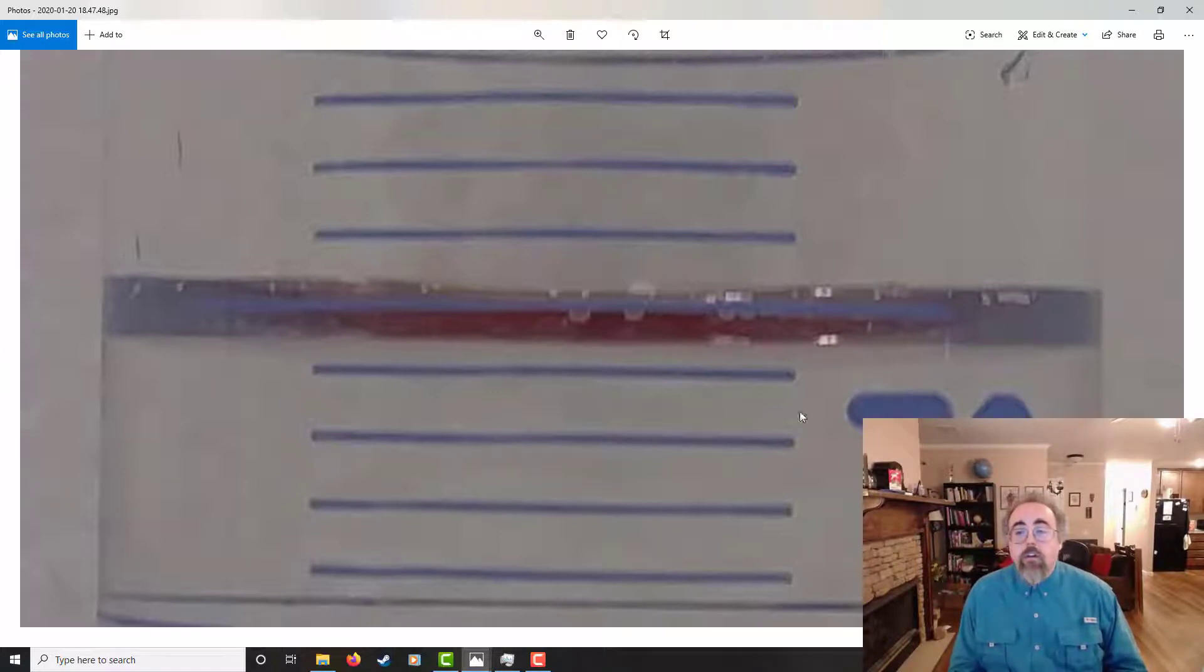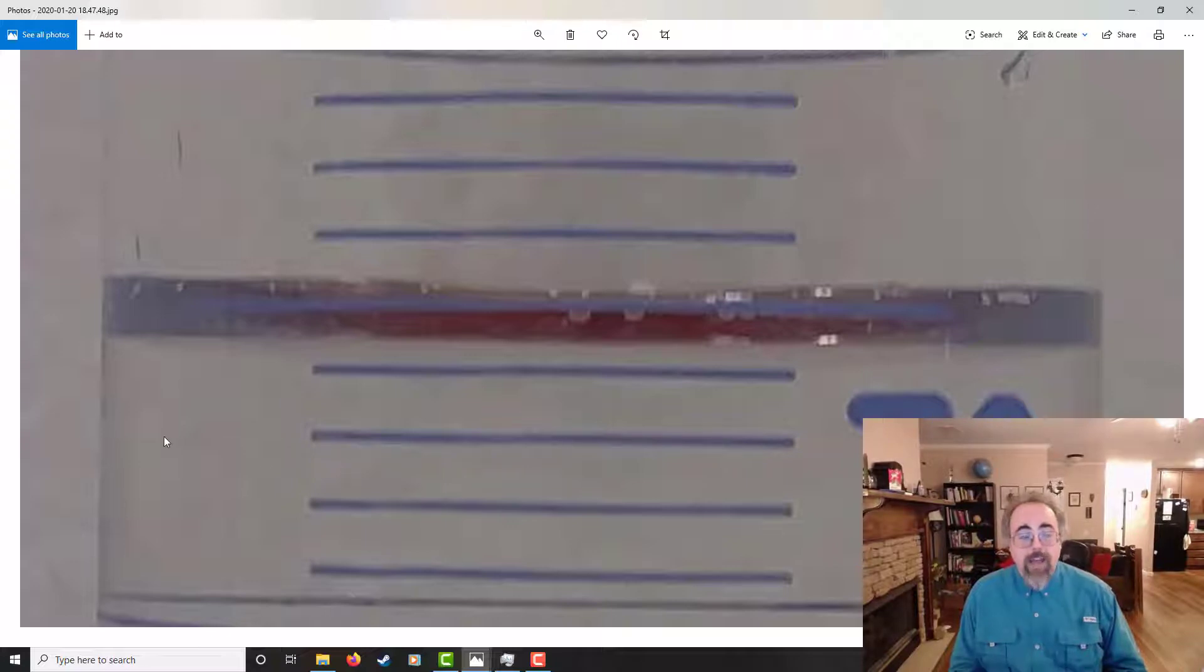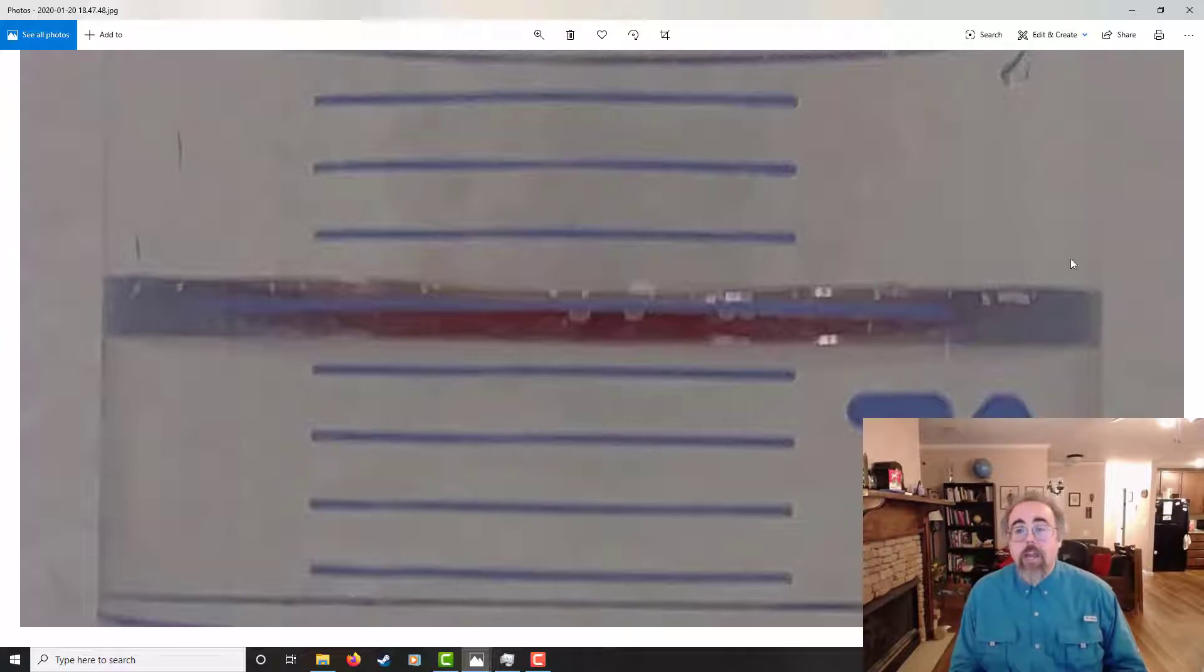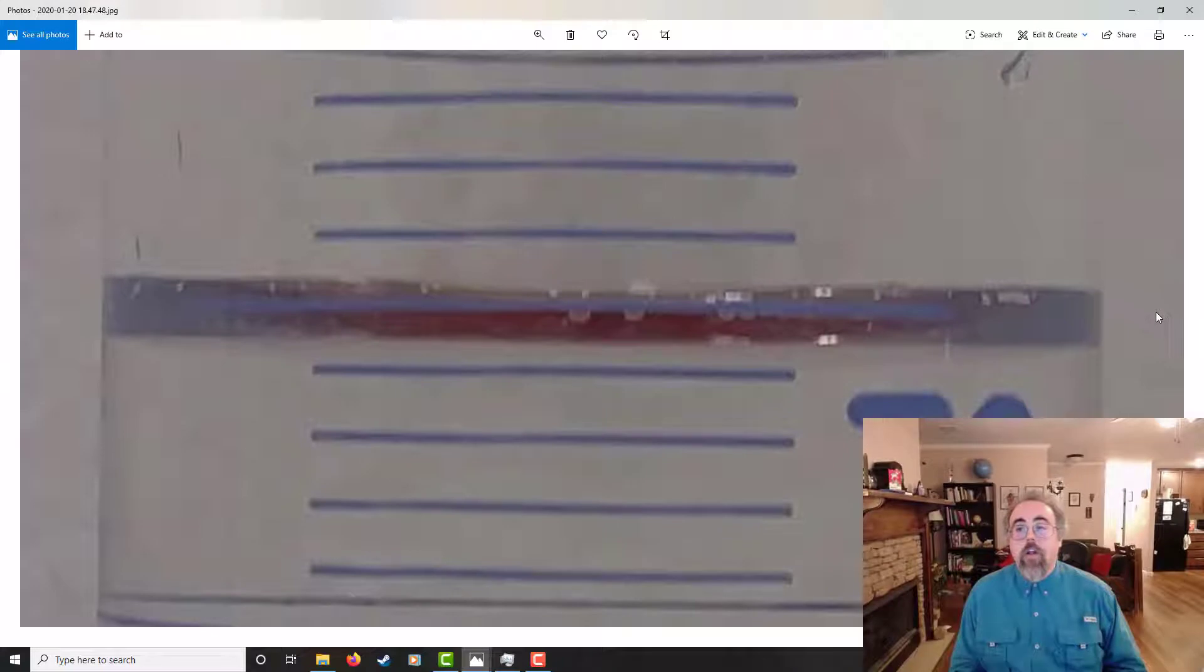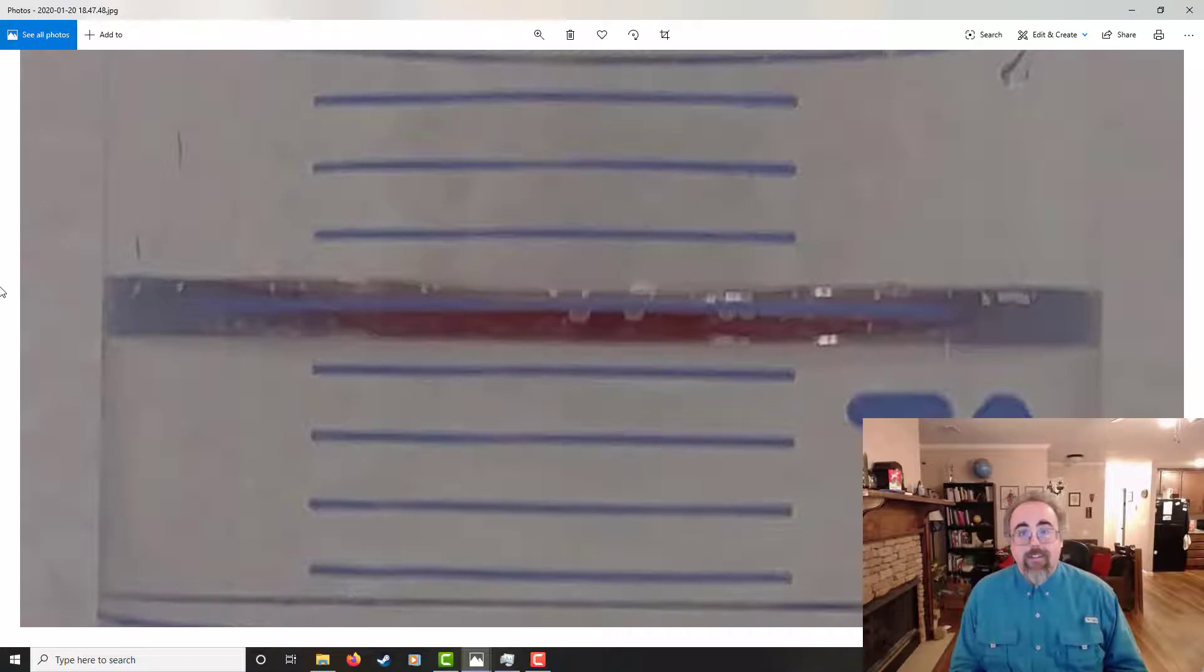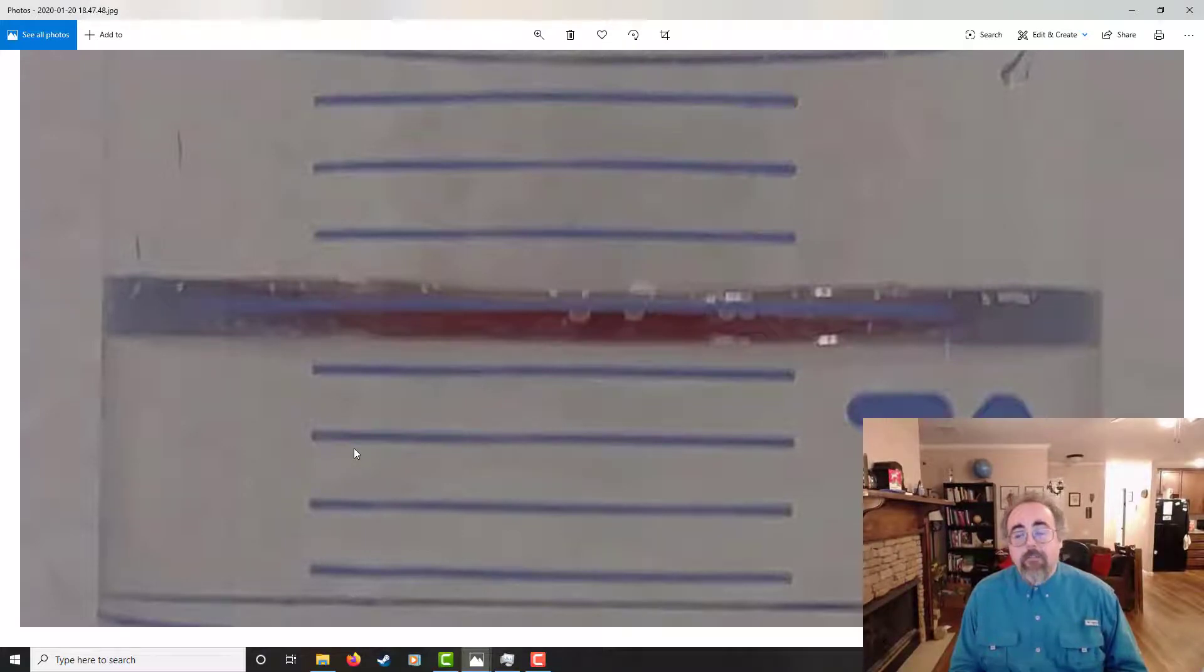So first, you'll notice it looks a little funny going on over here. What we're having is a bit of refraction issues. This is called a meniscus. This is very common. What's happening is the water is attracted to the glass. So the water is actually pulling against gravity and crawling up the sides of the glass. So down here, you've got air, glass, water, glass, air. And it's fairly straightforward. Above it, it's air, glass, air, glass, air. But down here, you've got a little bit more complication going on.